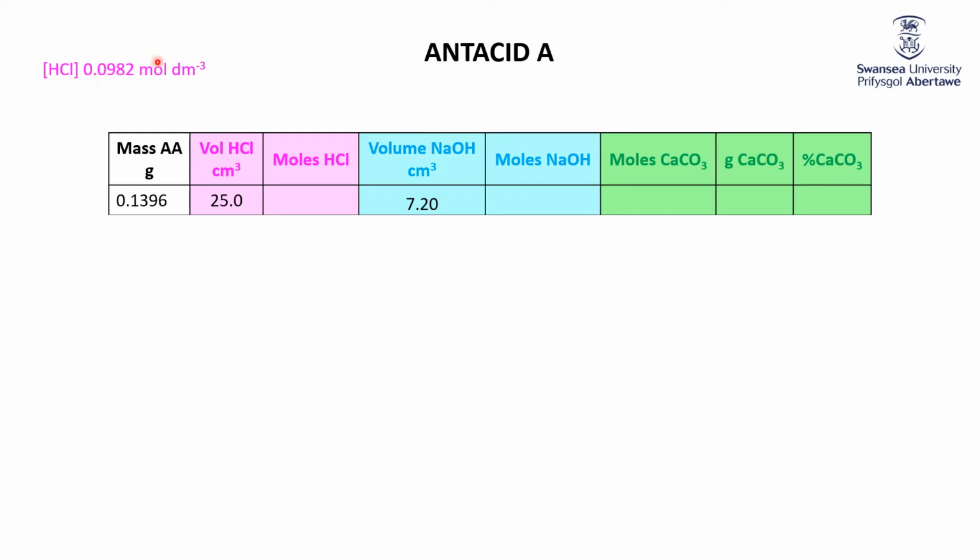Well, it's 0.0982 moles per cubic decimeter. Sodium hydroxide also supposed to be about 0.1, 0.0993 moles per cubic decimeter. Pretty much that's about as close as you're going to get, unless you get really, really lucky with it.